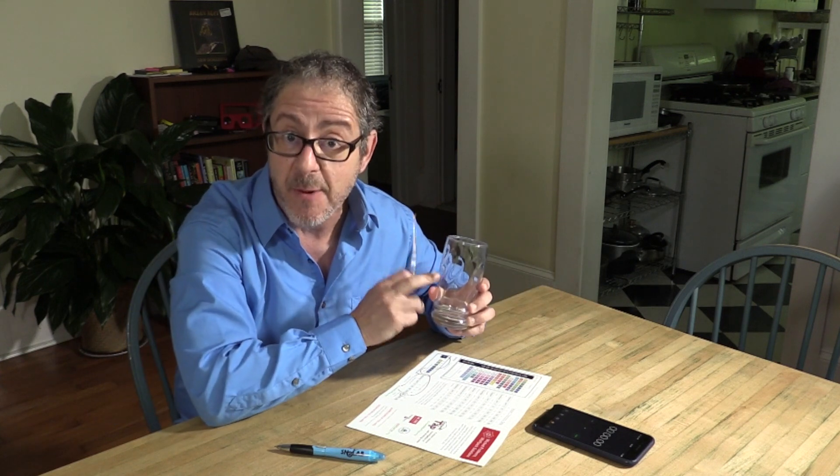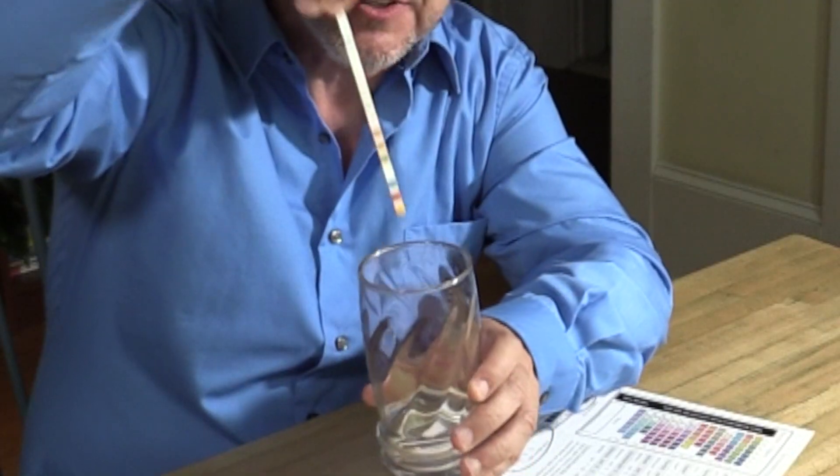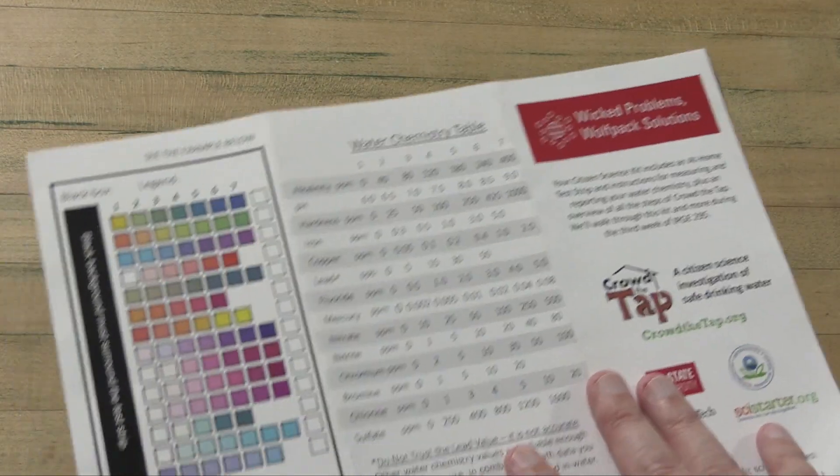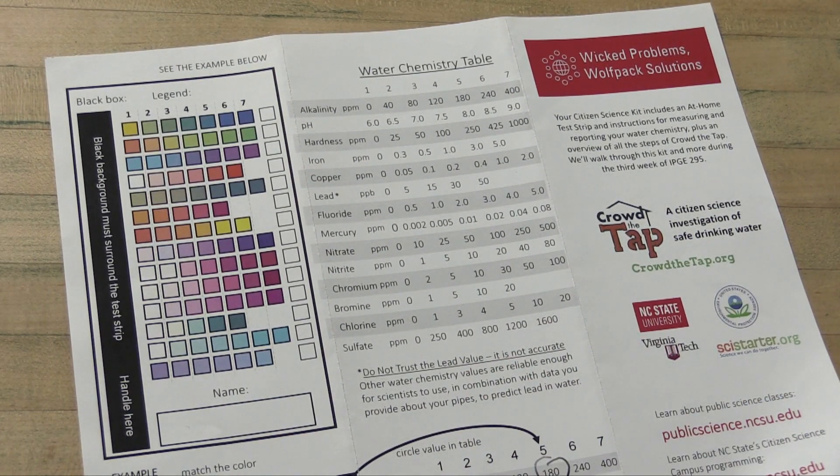This video is for people who received kit number one from a partner organization. It's a very simple kit — it just consists of the test strip and this brochure. You'll need to provide a glass of tap water from your home, tall enough that you can dunk all 14 of the test squares underwater. You'll also need a pen, a device to keep time with — I'm going to use the stopwatch on my cell phone — and a phone or camera to take one picture of your results. The brochure has step-by-step instructions, other information about the project, and on the other side there's a legend or key that we're going to use to interpret the results, along with the water chemistry table. We'll record our data there, then go to the Crowd The Tap website and add it to the questionnaire along with information about the pipes in our homes.